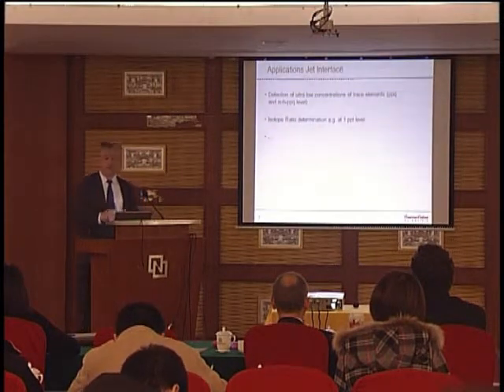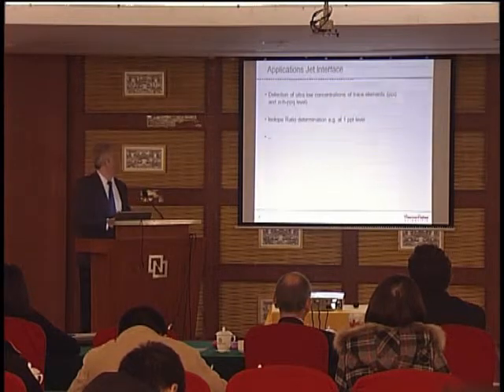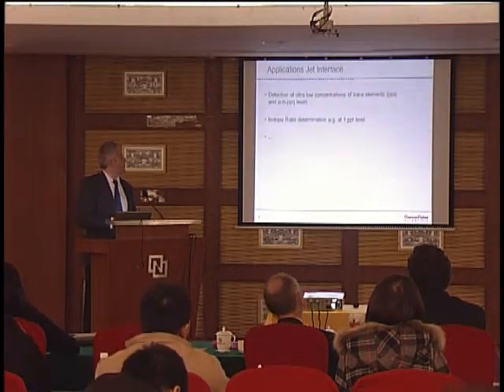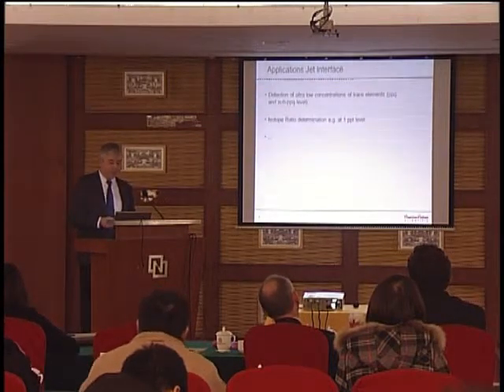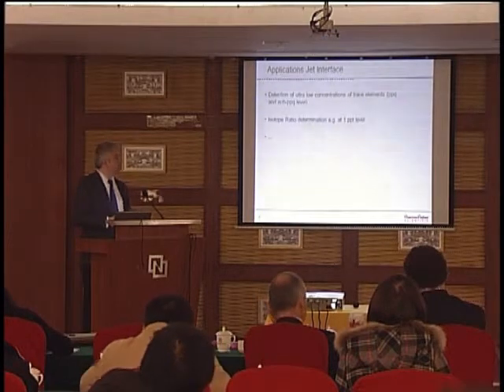So, we have nice sensitivity now, so what can we do with it? Are there applications for that? And I would like to show you only two applications we have run in our laboratory. The one is the detection of ultra-low concentration of trace elements.